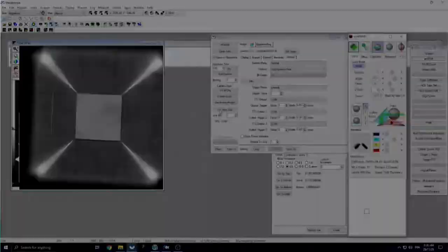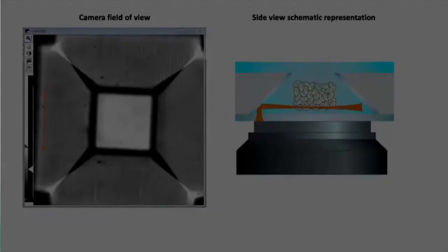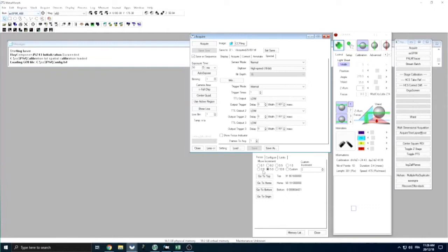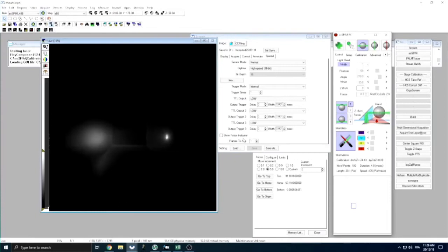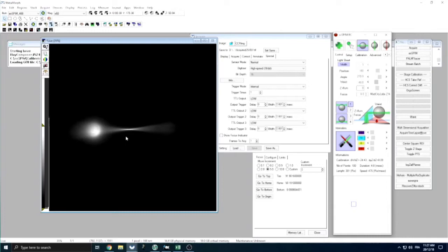We can then display this line in the middle of our mirror and enter it into the SOSPIN software. Scanning our laser beam along this line enables creating a light sheet perpendicular to our objective after reflection onto the mirror. We then displace the laser beam perpendicular to this line to change the axial position or depth of the light sheet. If we now switch on our laser and camera, we can see our laser beam after reflection onto the 45-degree mirror. We need to adjust the axial position of our objective so that it images the same plane excited by the laser after reflection. As we are using a Gaussian beam, we observe standard focalization of such a beam, with the waist portion coexisting with the interesting parts for which the optical sectioning will be optimal.